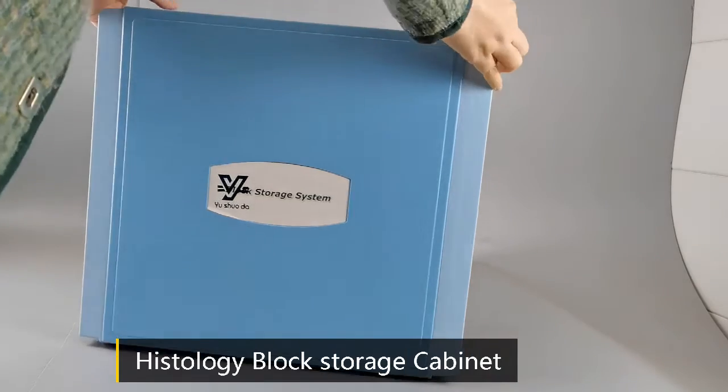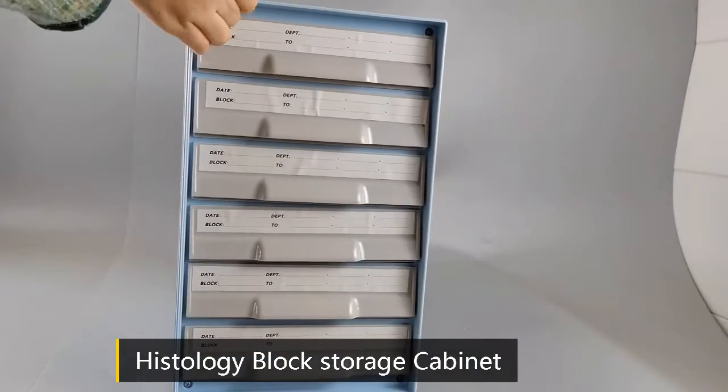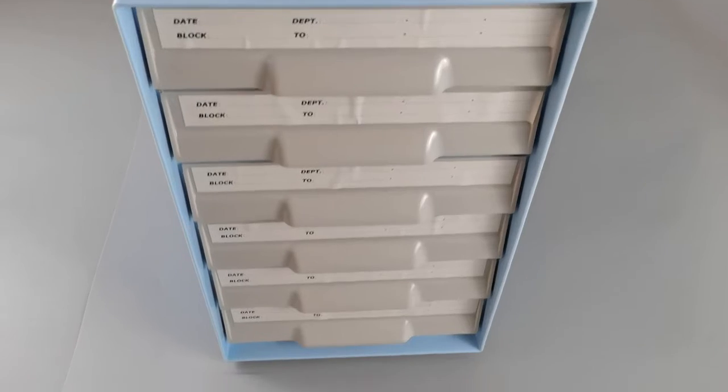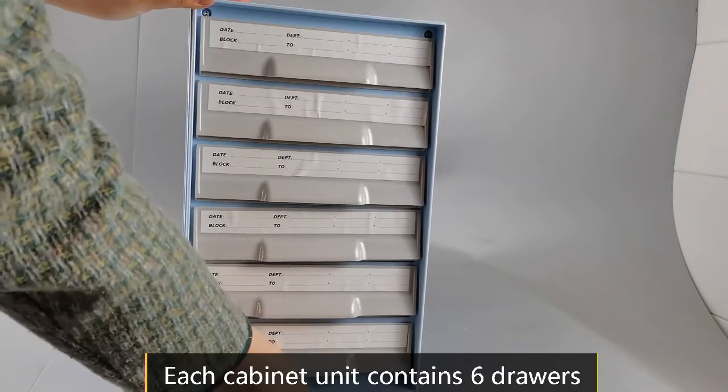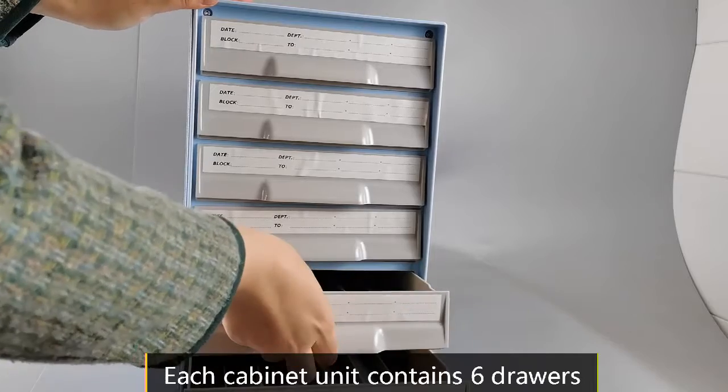Histology Block Storage Cabinet. It is molded from heavy-duty ABS material. The external dimensions are L445 x W245 x H400mm.